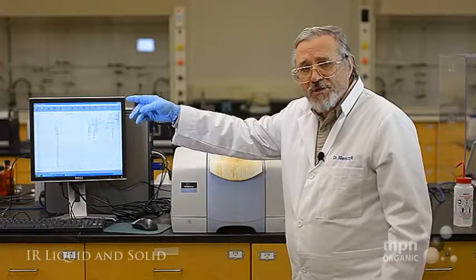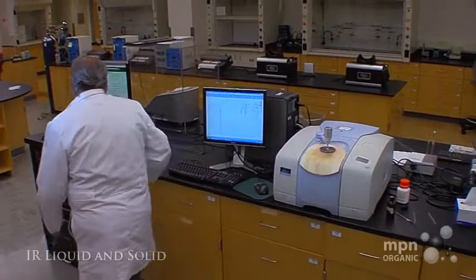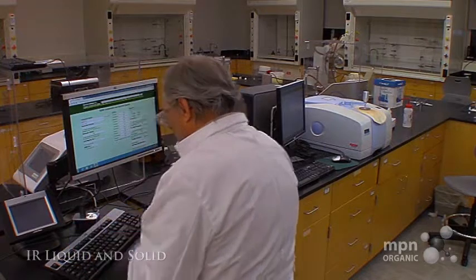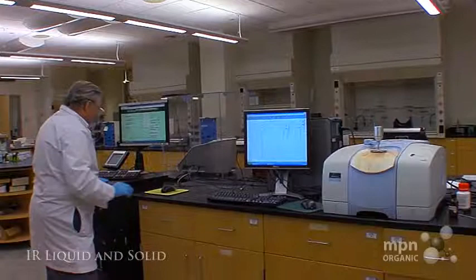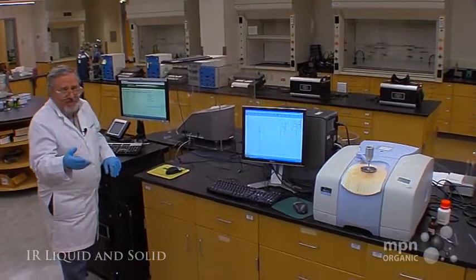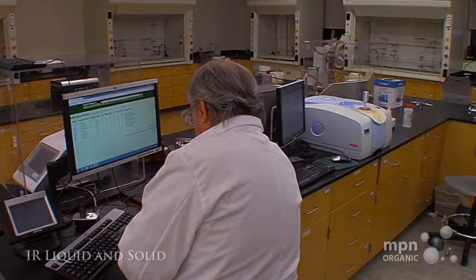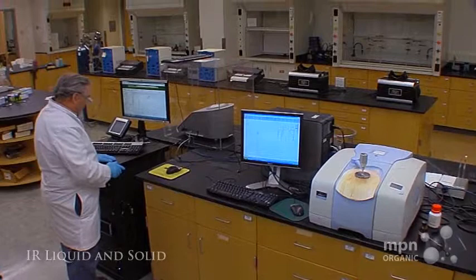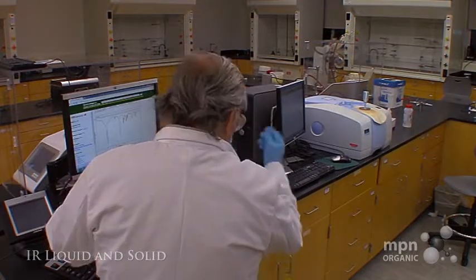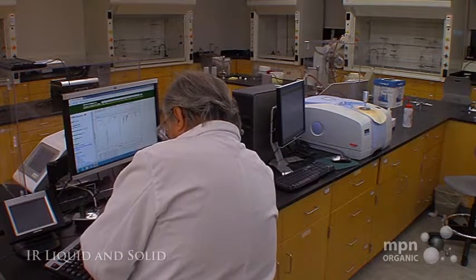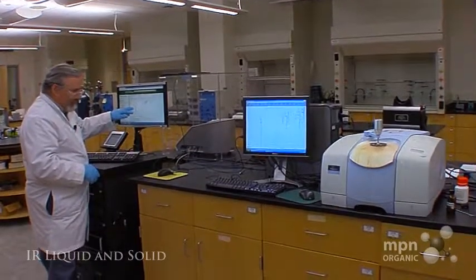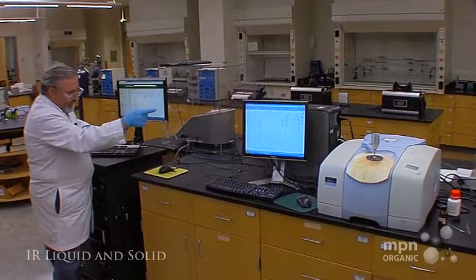Okay, we've acquired the spectrum. Now we're going to go over to the SDBS program and we're going to look at what's online. I'm going to type in palmitic acid and we're going to search for it. Now palmitic acid is a common name for hexadecanoic acid. It's a C16 acid so here's hexadecanoic acid and let's hit IR. You'll notice now that we actually have three options. Nonanoic acid only gave us two but with hexadecanoic acid being a solid we actually have three options and we're going to click KBR.